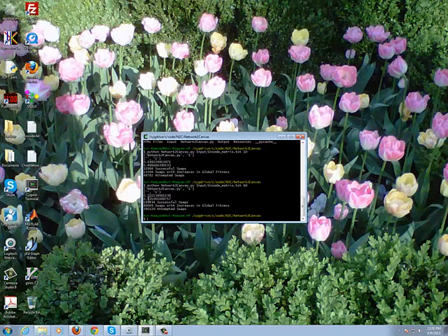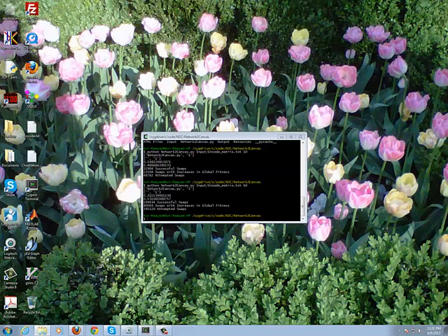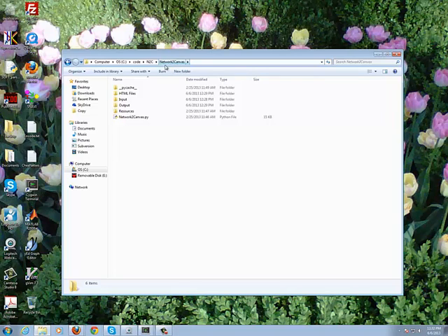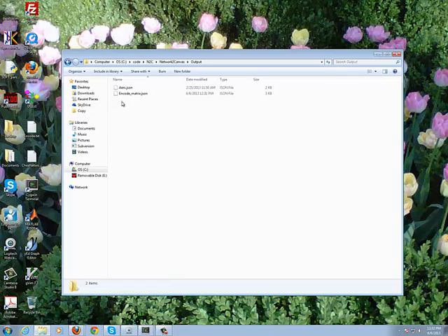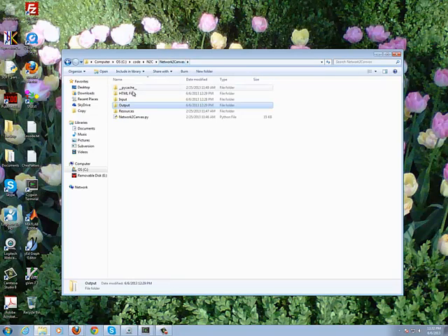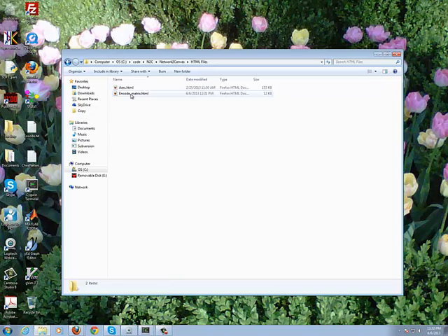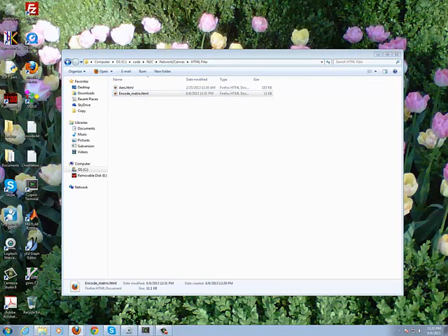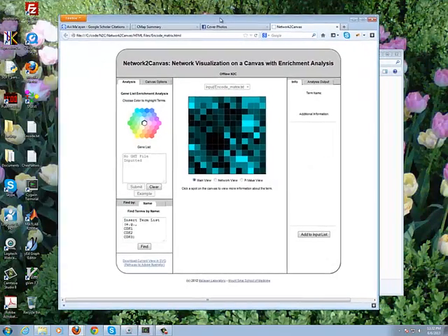Okay, so now if we use the browser we can just go directly to the folder where our output is. So we're going into the network-to-canvas folder. And this is where our output is. So this output is in JSON format and this is the encode_matrix. That JSON format tells network-to-canvas how to read the canvas. And then if we go to the HTML file, we have the full executed website.